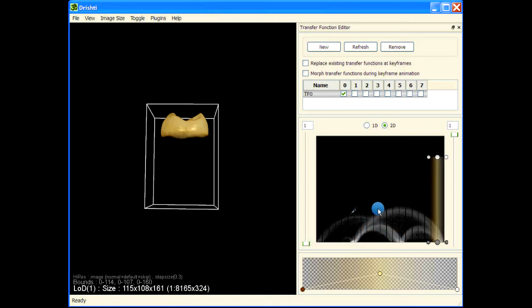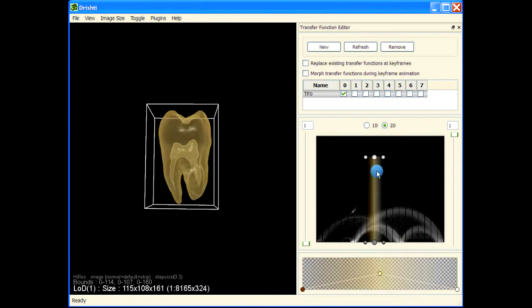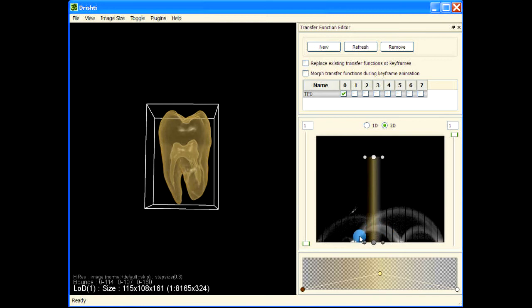These arches show us how the value is changing in the neighborhood of the voxels. This range here shows there is a phase where voxels have pretty low gradient magnitude, meaning they are in a homogeneous region. This arch tells us that voxels in this phase are lying close to voxels in another phase, so there is a boundary between these two sets of voxels.